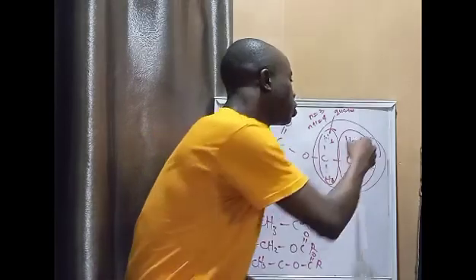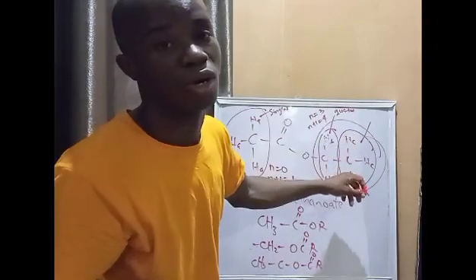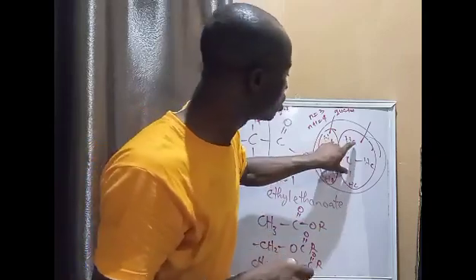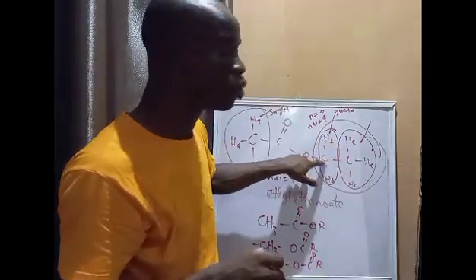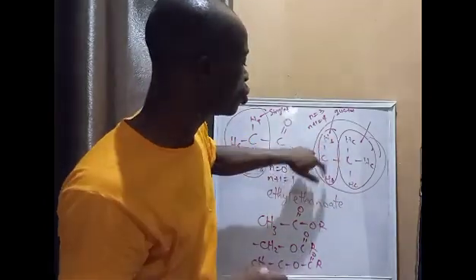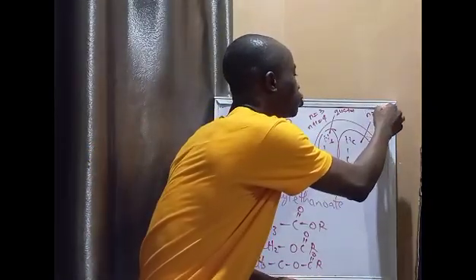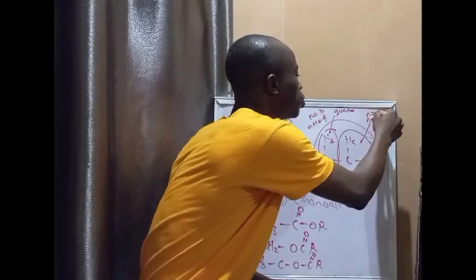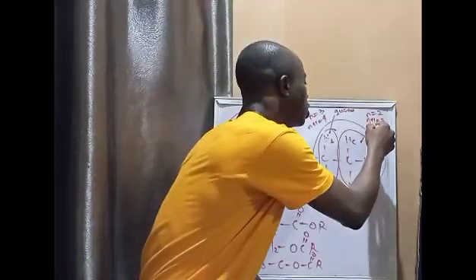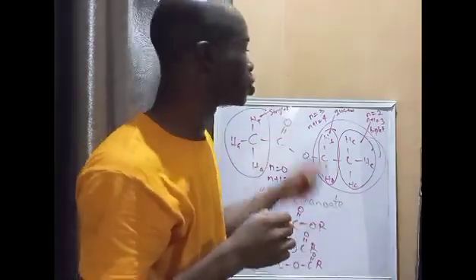Now for this last one, which we have here, the 3 hydrogens are also in the same chemical environment, they have the same chemical shift, and they are coming out as a single signal. But the multiplicity of their signal will depend on this one, which is adjacent to the carbon carrying the 3 of them. But this adjacent carbon here has just 2 hydrogens. So the n for this one will be equal to 2, and that means n plus 1 will be equal to 3. So the signal for this 3Hc will be a triplet. And that's what multiplicity does.